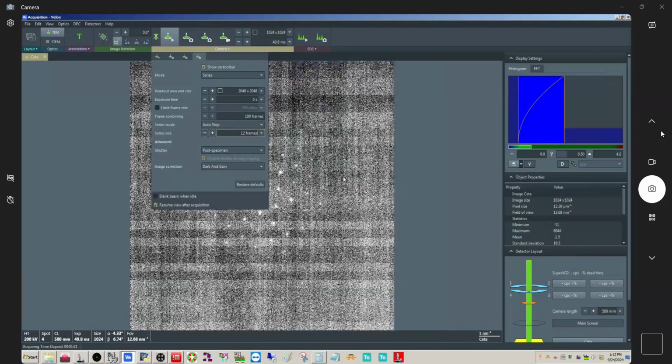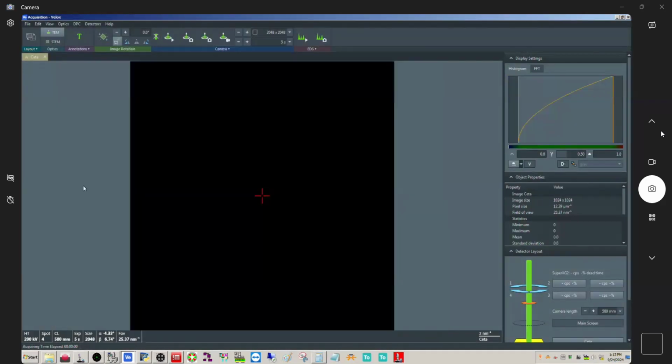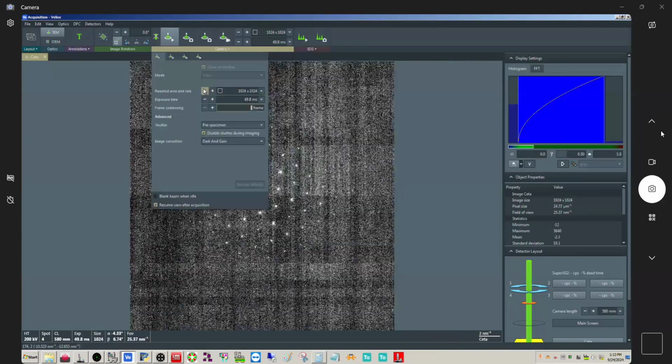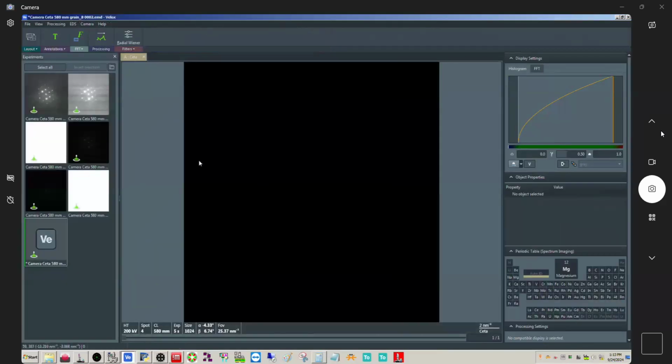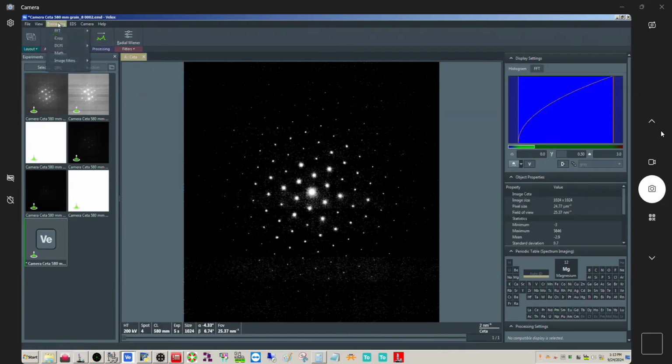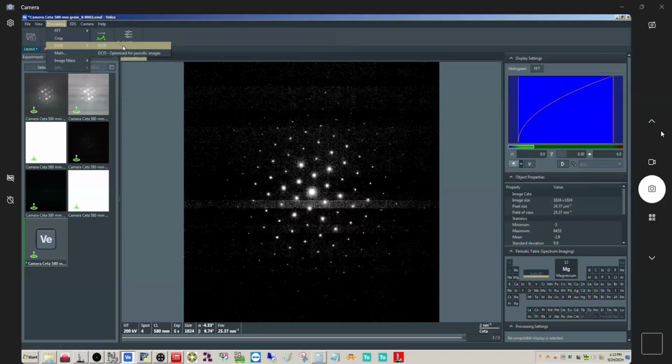So we're going to do basically 12 of what I just did, and then we're going to sum them together. Whoops, my bad. Made a little snafu there. If you click on it, it just stops it automatically. What I forgot to do was change this to 1K. All right, there we go. Now you don't have to wait for this to collect all of them. We can actually sum these as it's going. You don't need to do this for optimized periodic images because you're not doing lattice resolution here. So we should be able to just do DCFI normally.